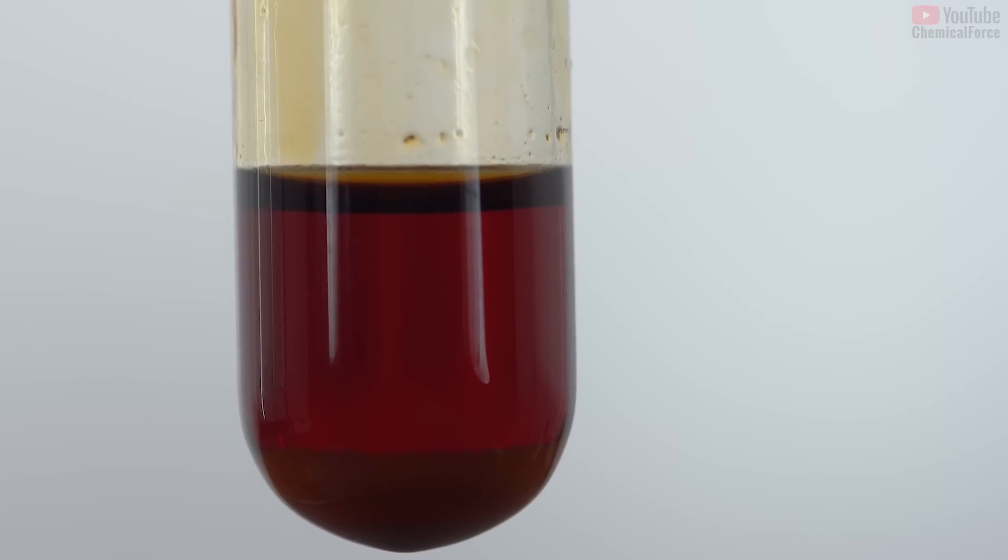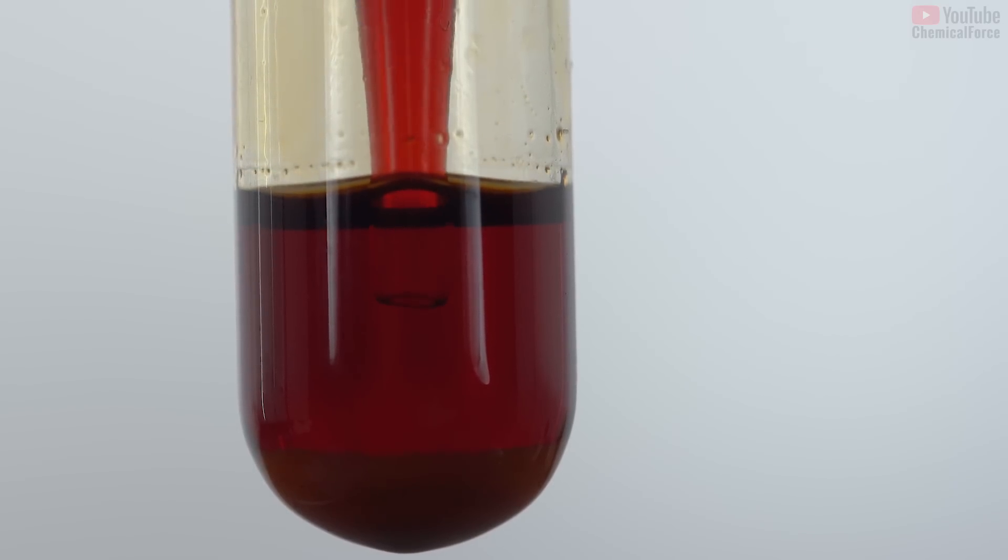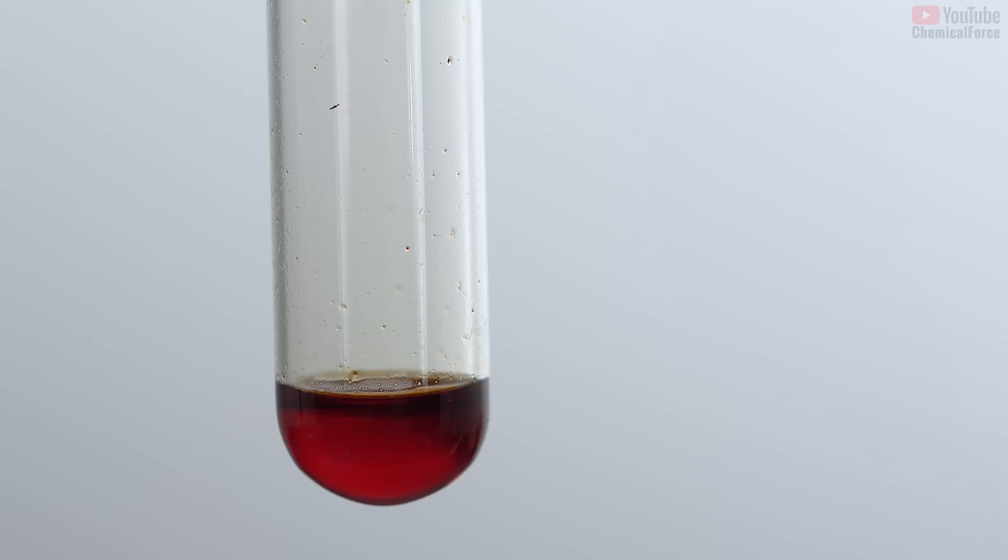Red phosphorus is insoluble in carbon disulfide. However, if we add red phosphorus to the phosphorus pentabromide dissolved in carbon disulfide, the solution will become colorless because phosphorus pentabromide turns into phosphorus tribromide, which represents a transparent liquid.